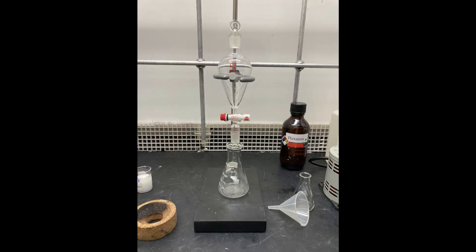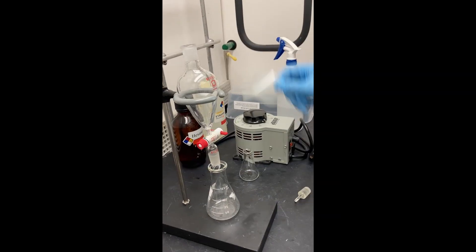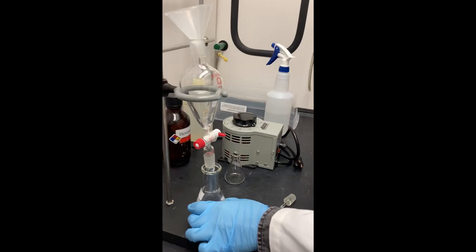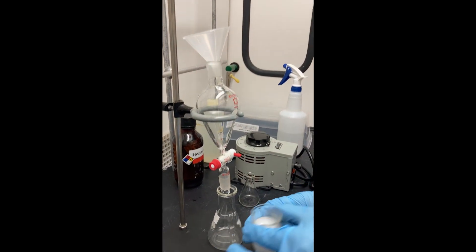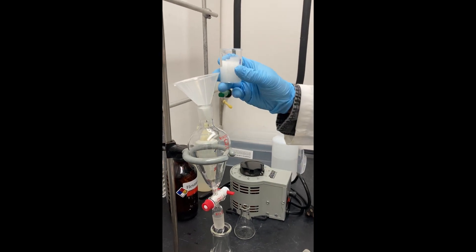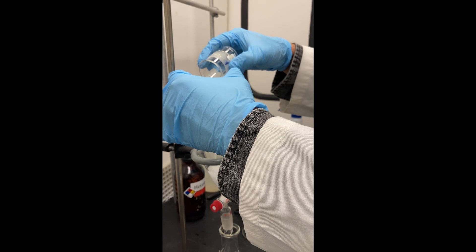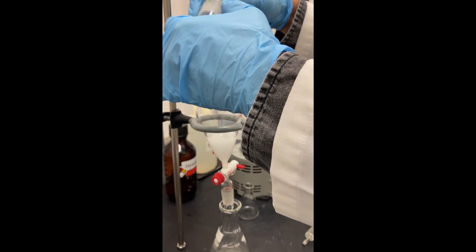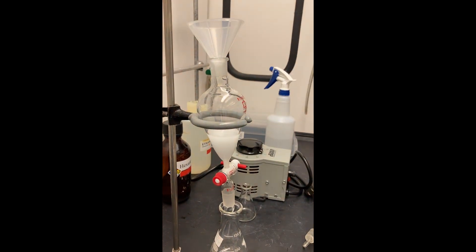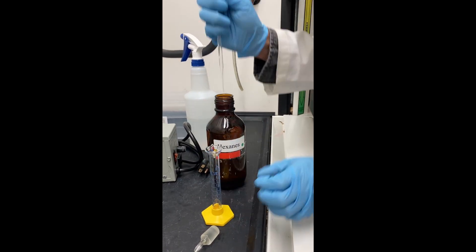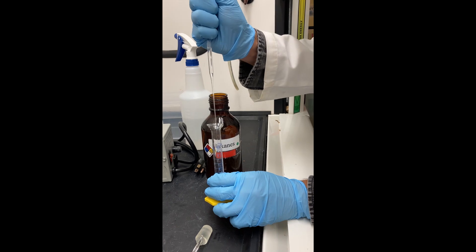Next, set up your glassware for the extraction using your separatory funnel. Start by adding the 25 milliliters of distillate to your separatory funnel. Then you'll want to measure out 10 milliliters of hexanes and add them to the separatory funnel as well.